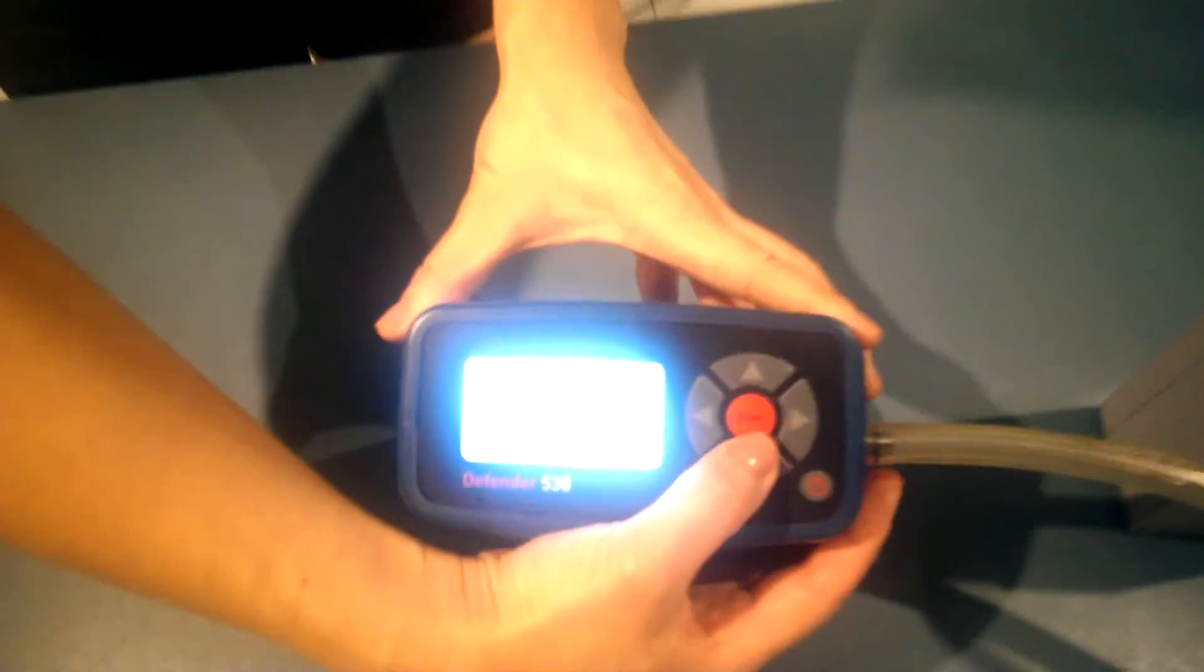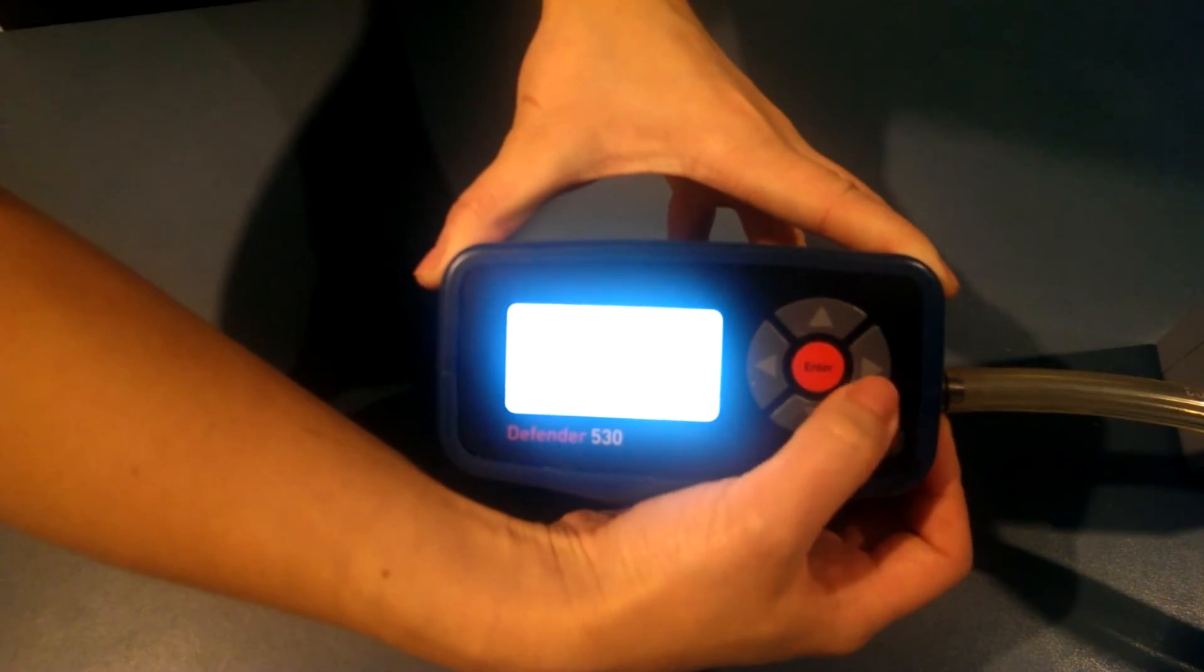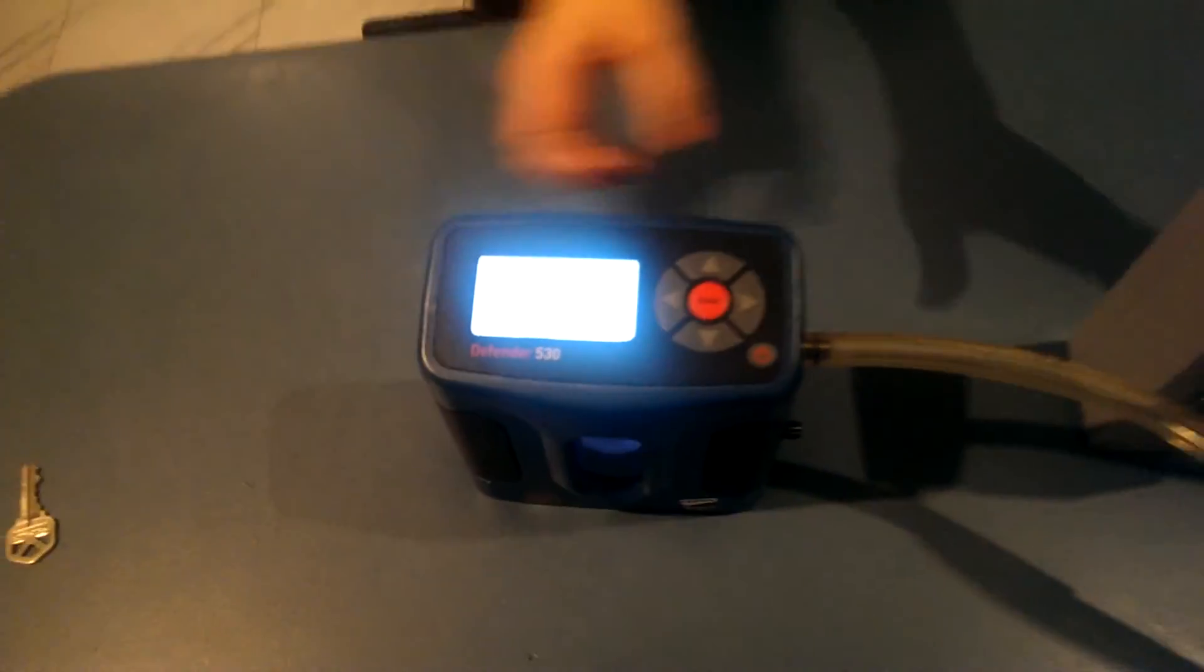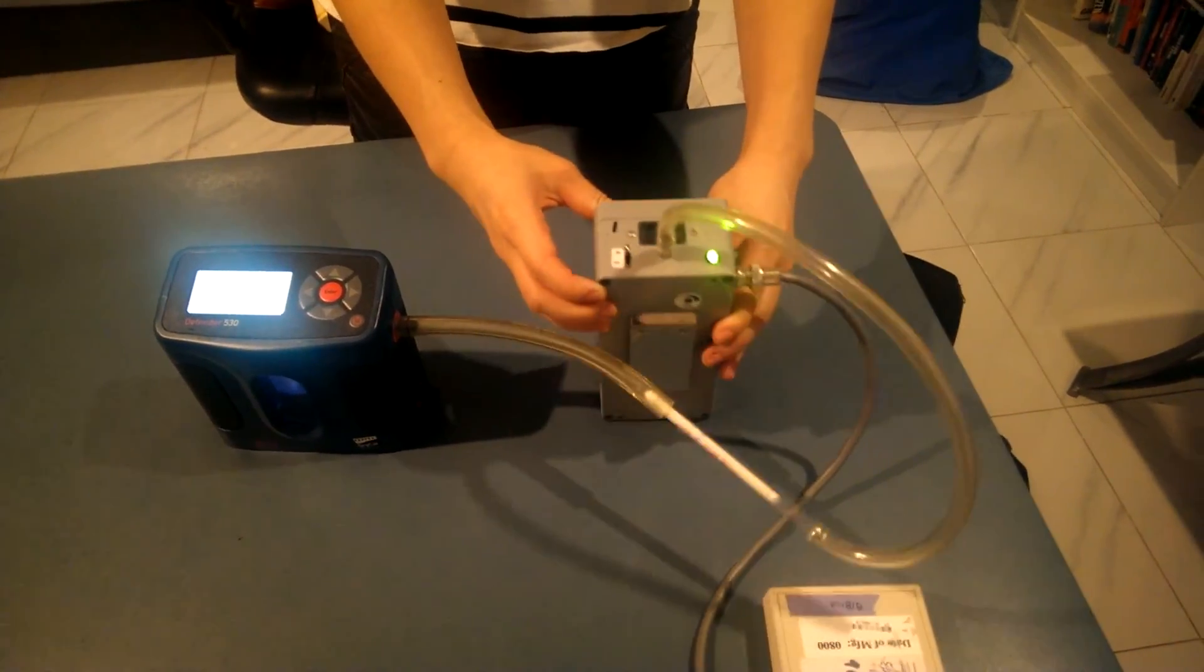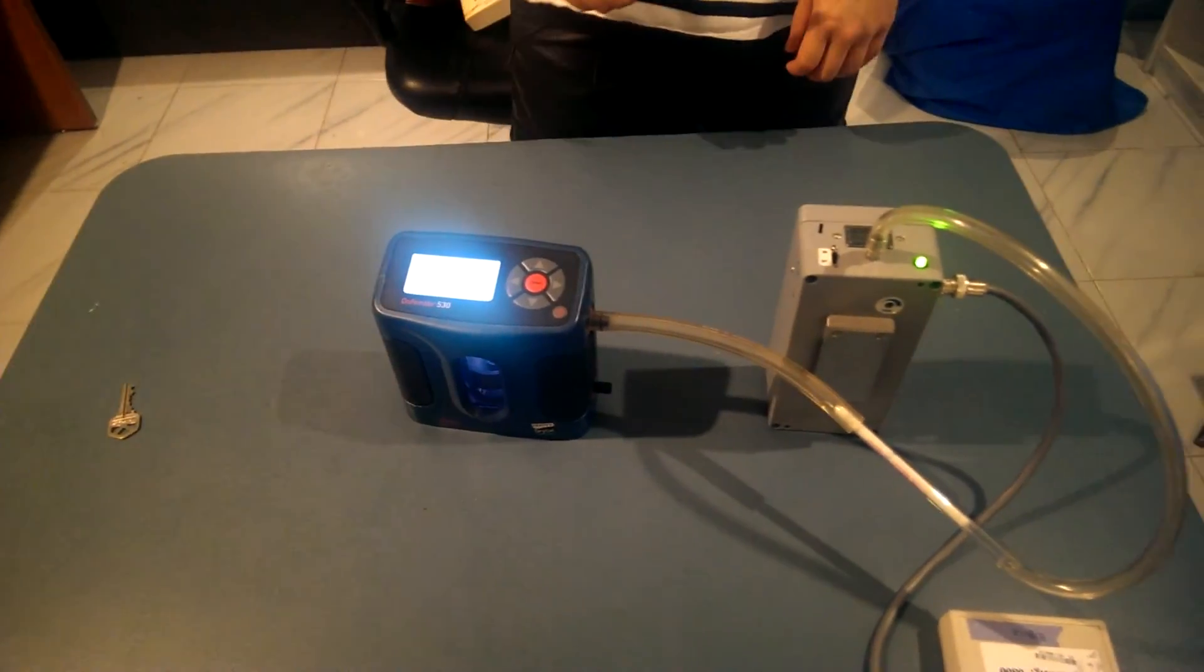On the calibrator, select measure then continuous measurement to begin measuring air flow. Turn the switch of your pump on. The display on the calibrator should read 1.5 liters per minute.